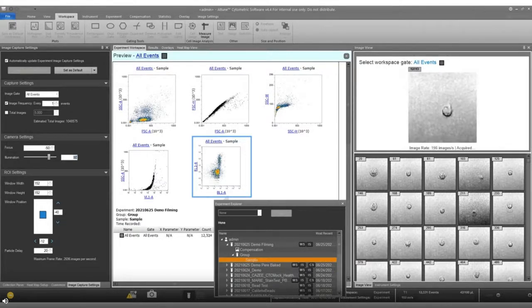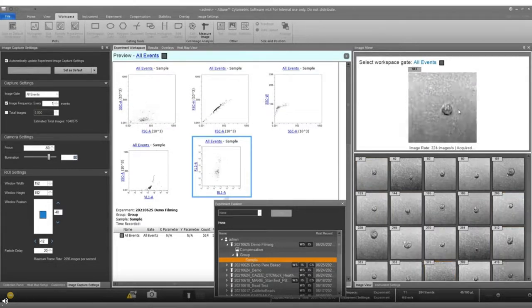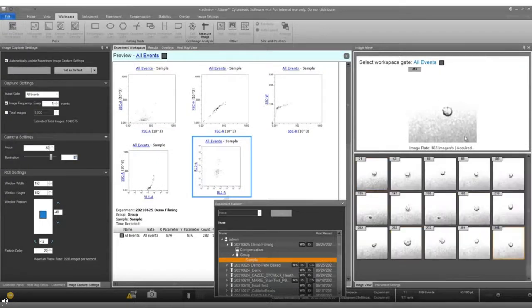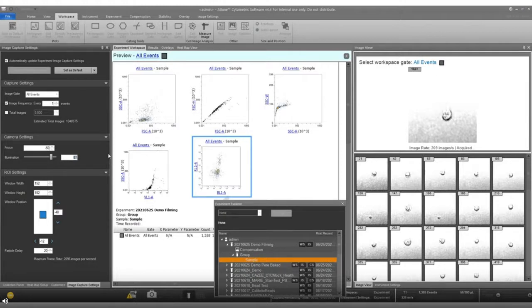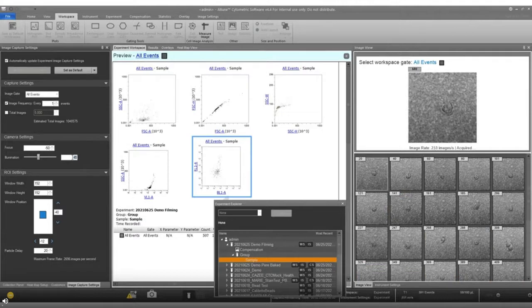If I try 80, that's going to be much darker. Let's see, much heavier shadows on these cells. So these are illuminated with a 405 nanometer laser. Let's go back up. Oh, way too bright. Yeah, completely saturated. So I think we were already in maybe our sweet spot there. Whoop, nope. 45. There we go. 48.